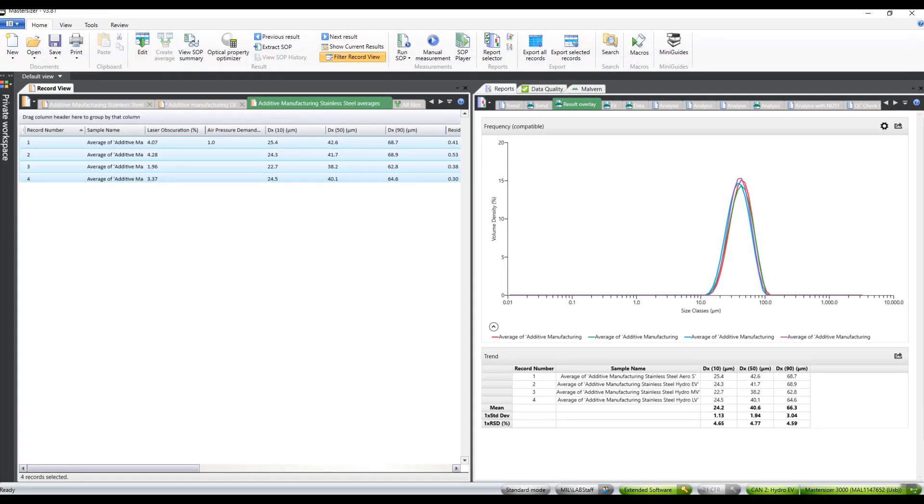In all cases, once complete dispersions are established, the results can readily identify any out-of-spec material in the metal powder, whether through the percentiles or by looking at the percentage of results occurring above or below a certain size value.